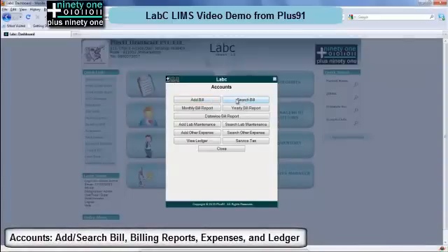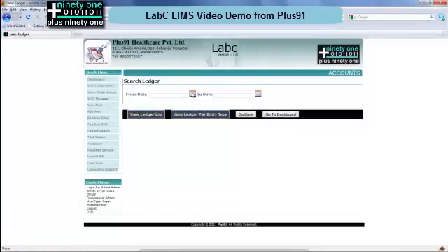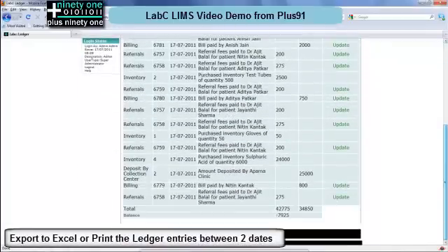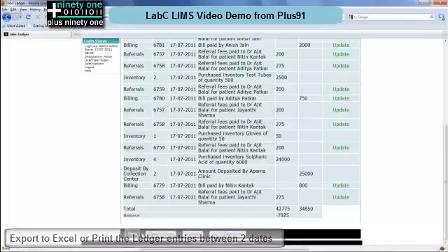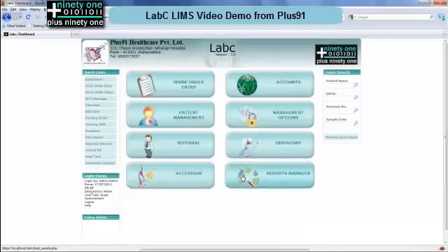The accounts module allows you to add bills, search bills, look at bill reports across various time periods, add lab maintenance and expenses, and review the ledger. The ledger will show you all the income inflows and outflows from the lab. This can be printed or exported to Excel. Between two dates you can see the ledger entries for your lab, giving you a good idea of how the accounts are going. You can also update the service tax if required.